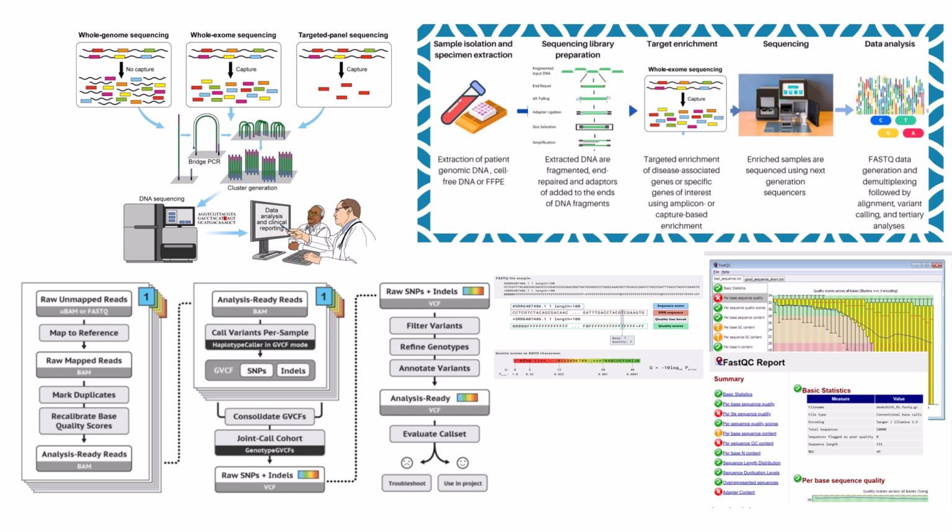Like dictionaries of variations. Kind of, yeah. Databases like dbSNP, 1000 Genomes, they list genetic changes already seen in thousands, even millions of people. These are vital for helping us quickly separate a common, likely benign change from something rare that might actually be linked to a disease. Okay, map and reference books of common variations.